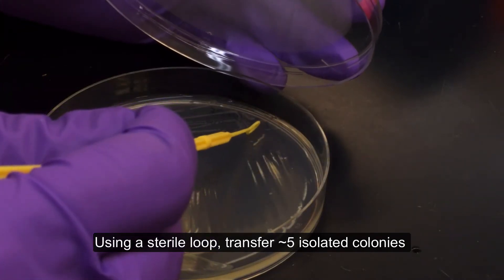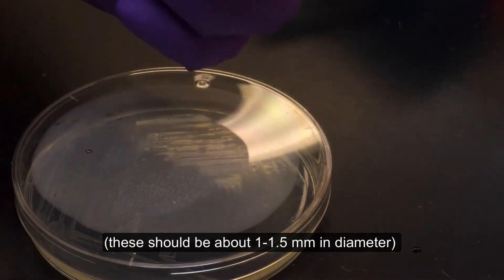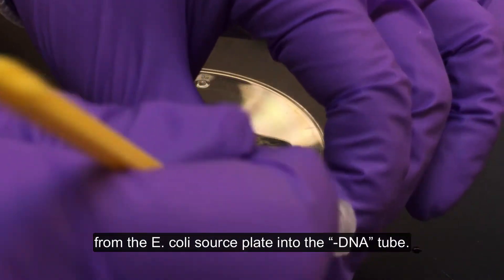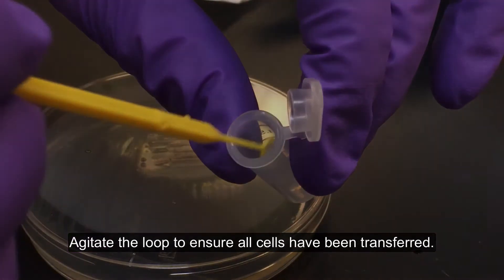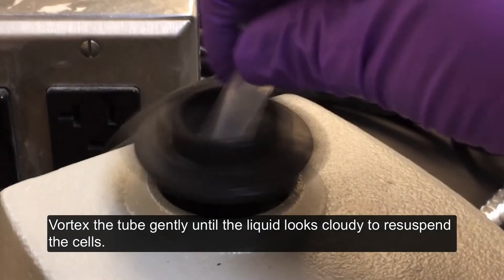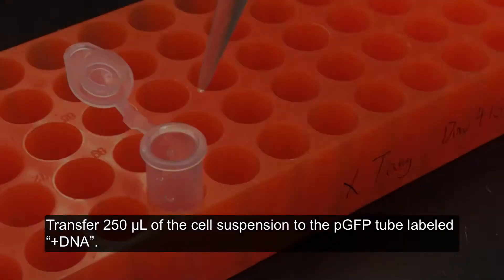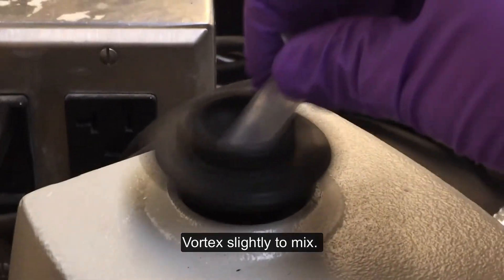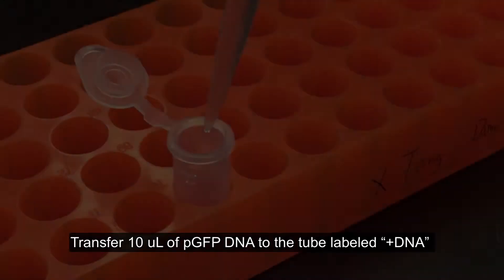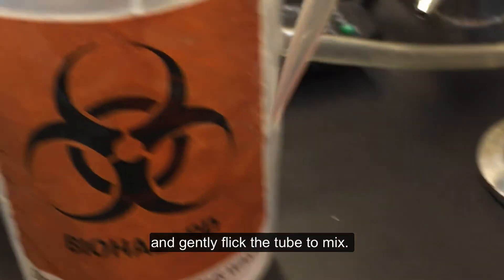Using a sterile loop, transfer approximately five isolated colonies — these should be about 1 to 1.5 mm in diameter — from the E. coli source plate into the minus DNA tube. Agitate the loop to ensure all cells have been transferred. Vortex the tube gently until the liquid looks cloudy to resuspend the cells. Transfer 250 microliters of the cell suspension to the PGFP tube labeled plus DNA. Vortex lightly to mix. Transfer 10 microliters of PGFP DNA to the tube labeled plus DNA, and gently flick the tube to mix.